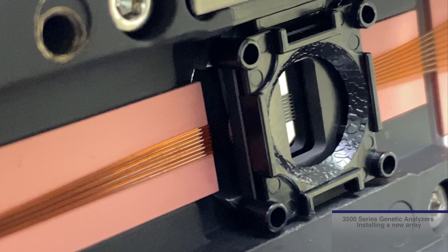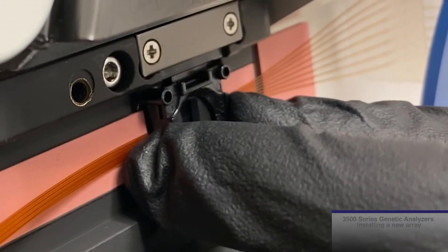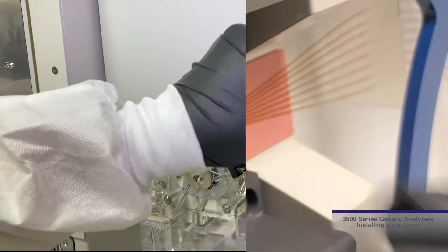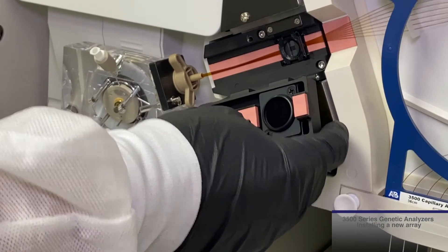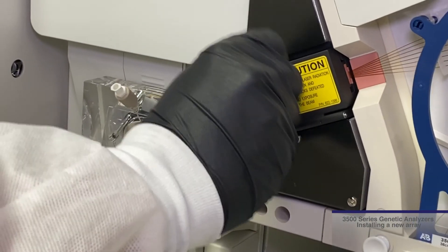View the detection cell from the side to ensure it is laying flat in the window. Once in place, a gentle tug of the cell will show little to no movement. An improperly placed detection cell array may be torqued or not lay flat in the window and may show movement. Please ensure there is no movement of the detection cell window before closing and locking the detection cell heater block door.